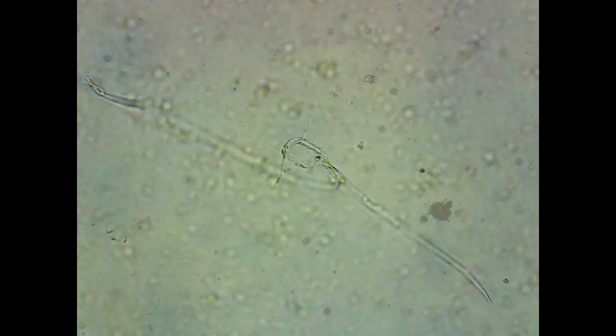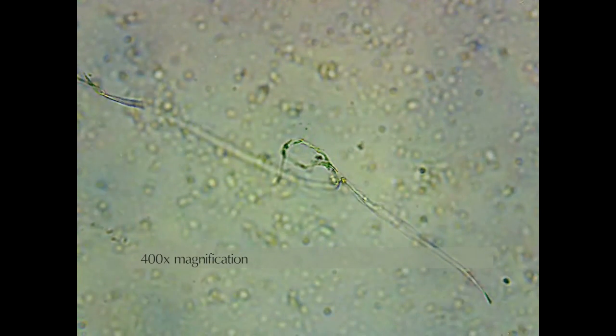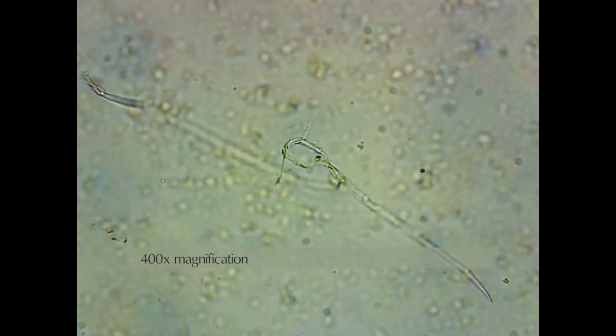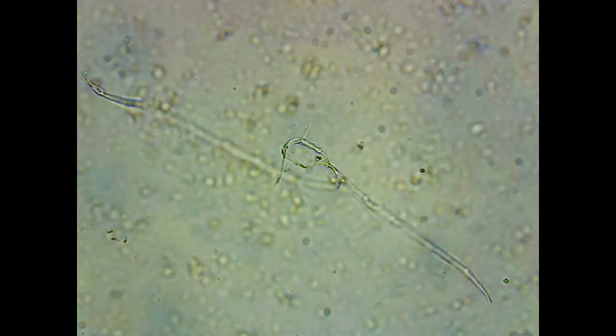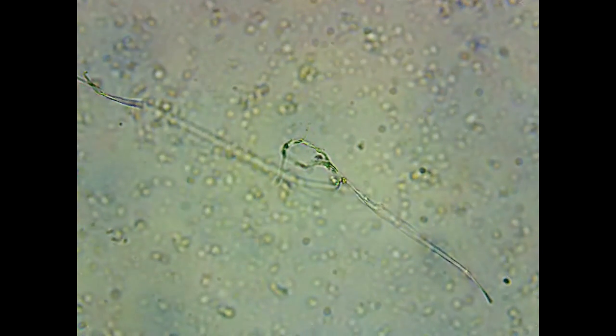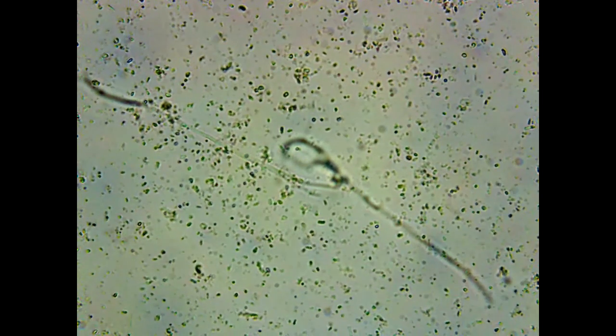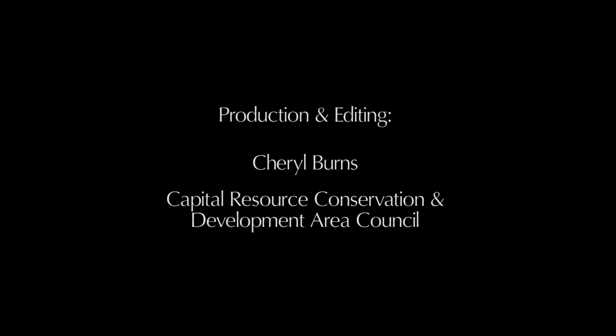While it is more likely that this image is simply a twisted fungal strand, it looks like specific types of fungal hyphae that lure and capture nematodes using similar loops. Whether capturing nematodes or filtering runoff, the life in the soil is effective at keeping their own environments clean.